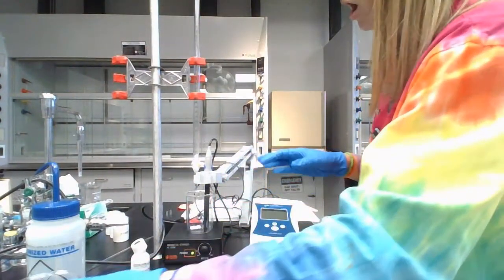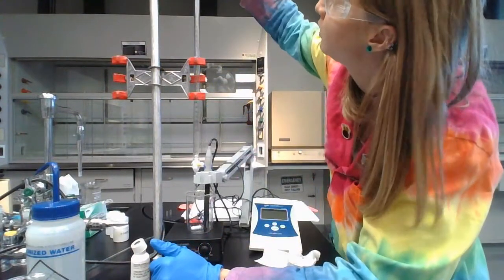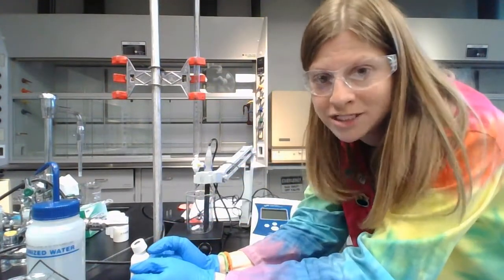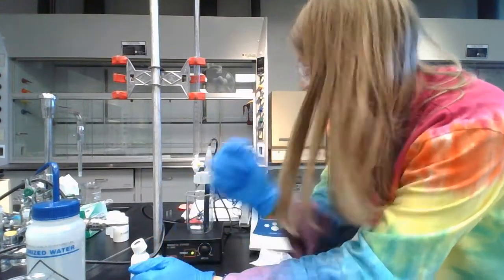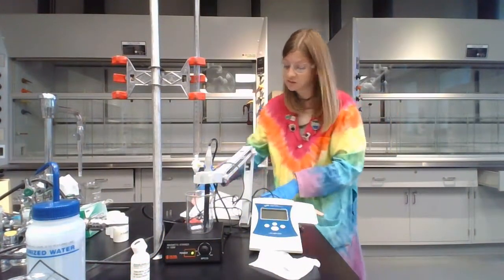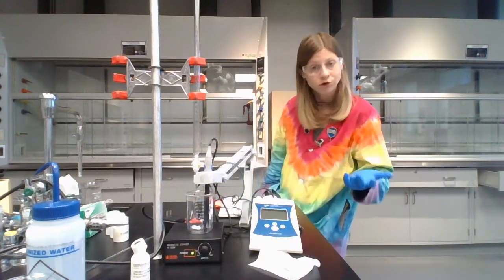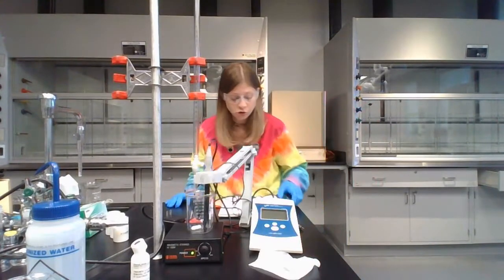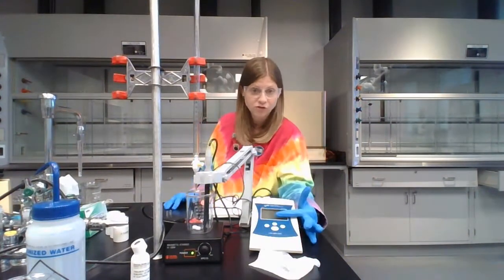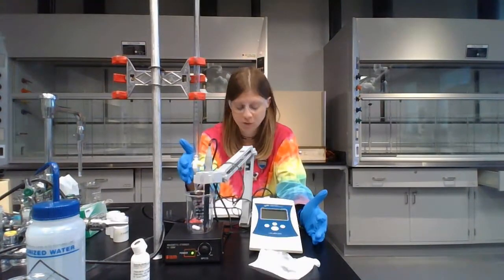Okay, so you'll get this all arranged. Again, your burette will be filled, so that way the level of sodium hydroxide is right at the 0.00 mark. And then we're ready to start our titration. So the data table for this, on page 73, there's data table for 3 trials. We're doing trial 1 right now. So you're going to be recording the pH value from your pH meter every time we add a certain amount of sodium hydroxide.